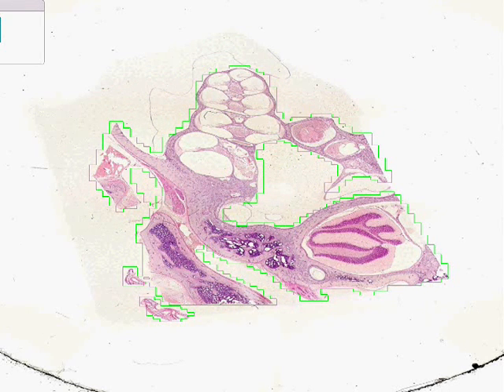I would like to go over the inner ear as briefly and clearly as possible because it's always an area of confusion, mostly because there are so many tiny cells that are all named after different people. But from an identification point of view, I think we could nail this down in a couple of minutes.